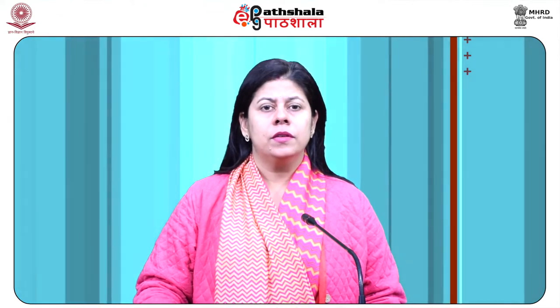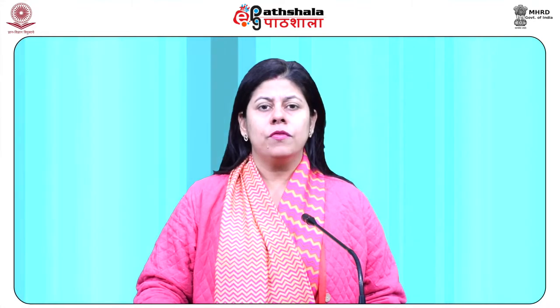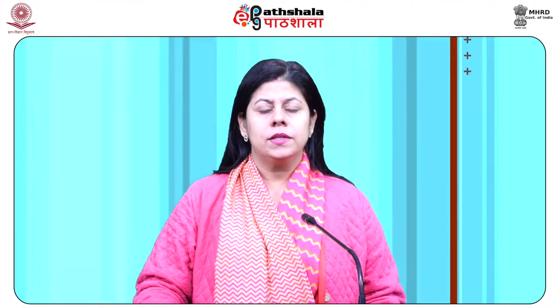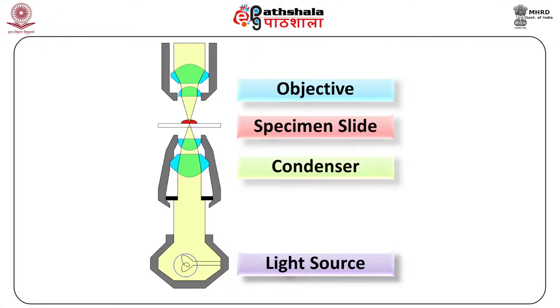Arms are generally present to carry slides. Light source. Various sources of light can be used. At its simplest, daylight is directed via a mirror. Most microscopes, nevertheless, have their own manageable source of light, generally a halogen lamp.